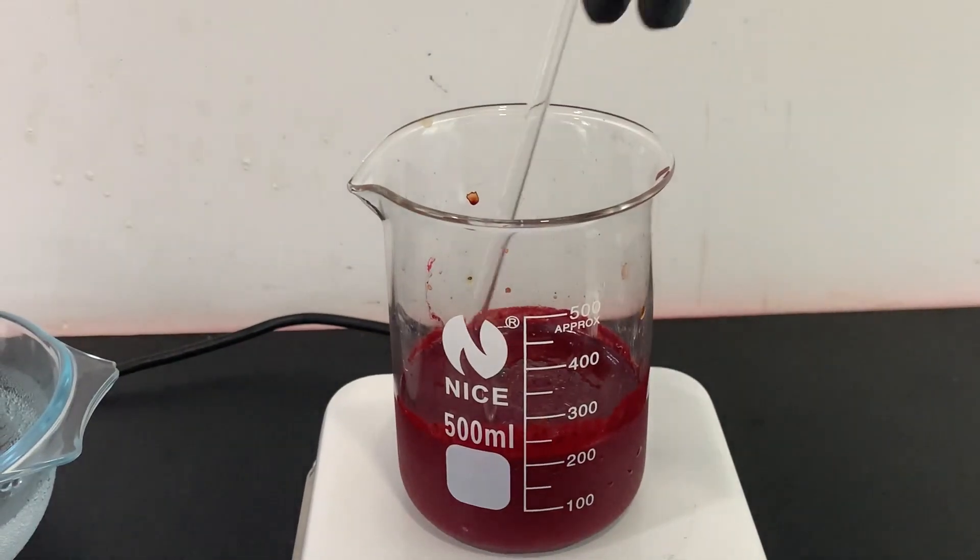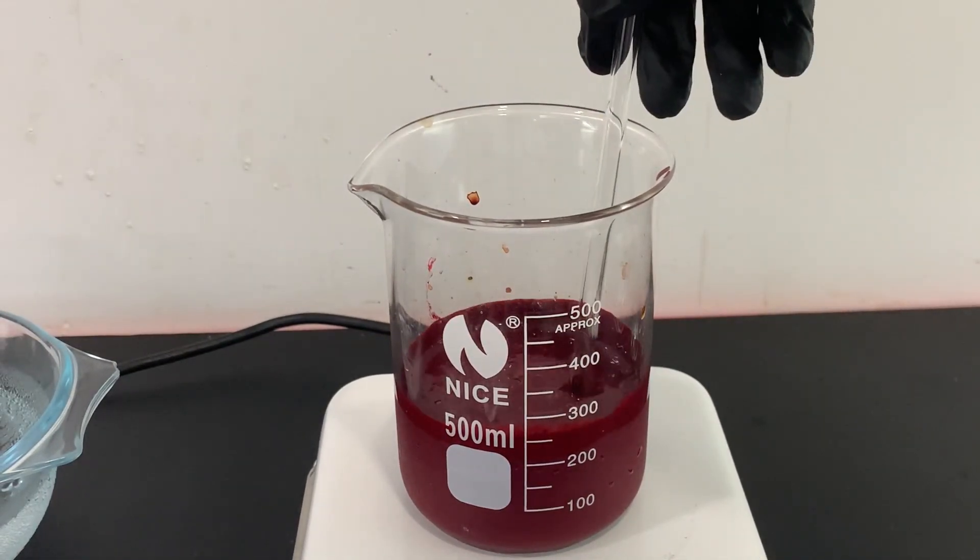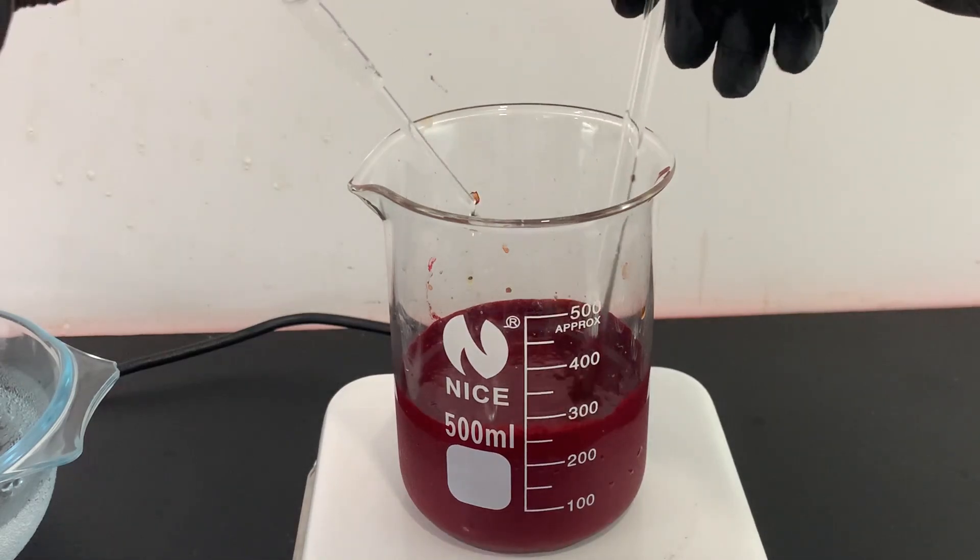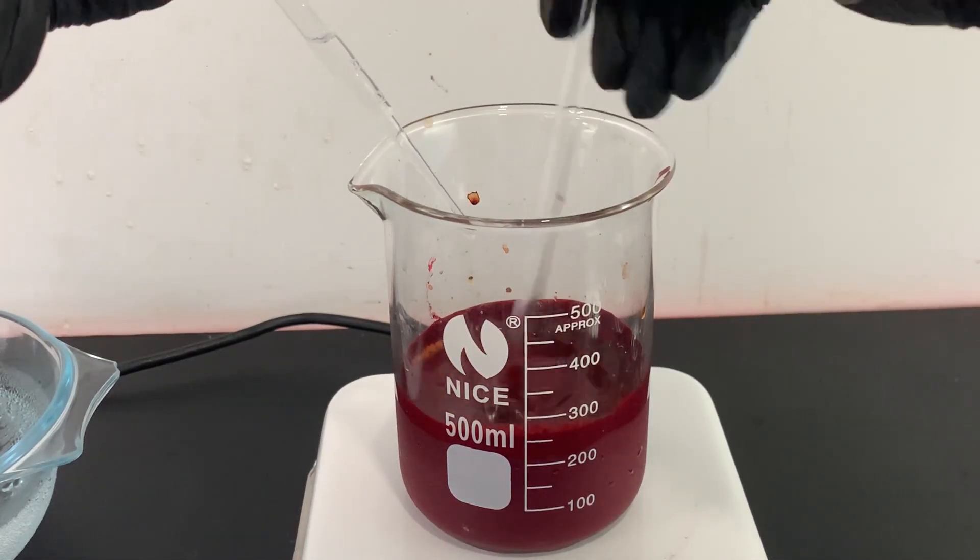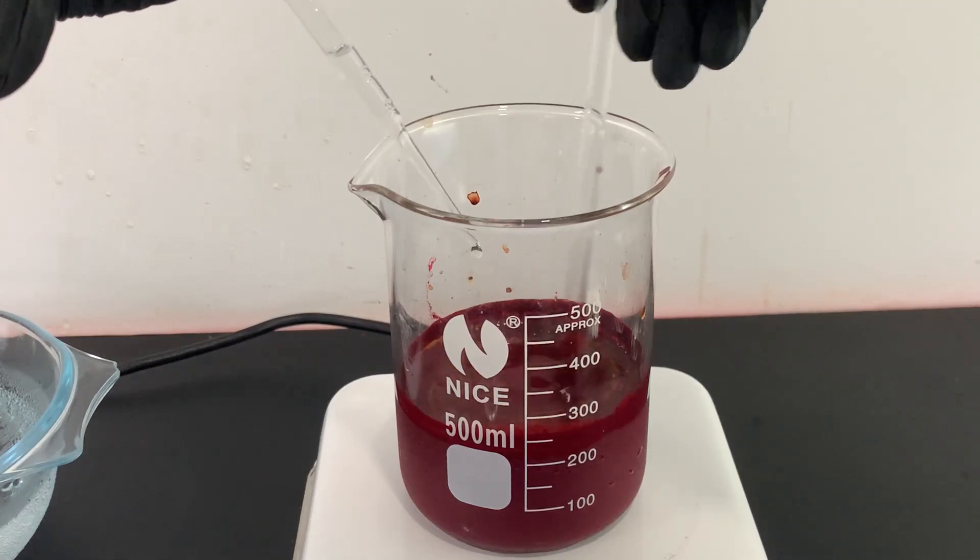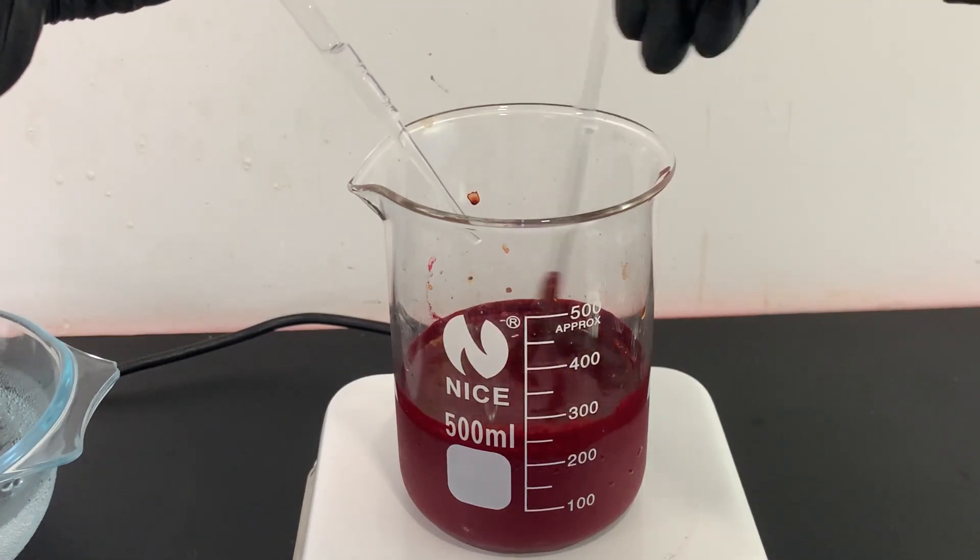I started slowly adding 30 milliliters of a 10% sodium hydroxide solution. I made the solution by dissolving 3 grams of sodium hydroxide in 30 milliliters of water.